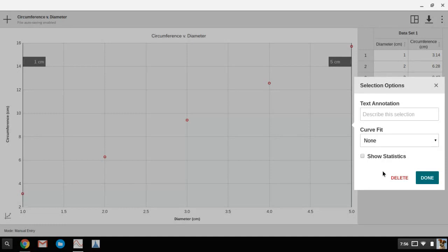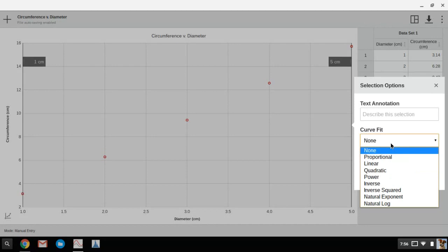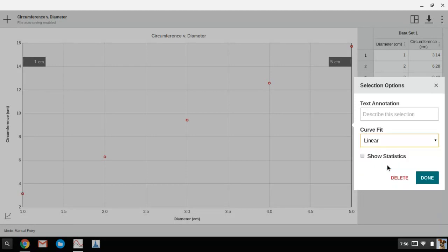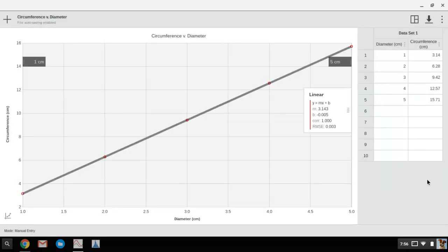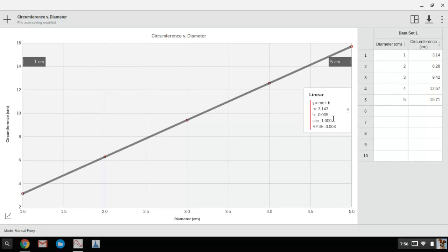And you get this box of options that shows up, and under curve fit, if it is a linear line, straight line graph, then we're going to choose linear and click on done. And there's my line of best fit. And then in this box right here we have our M, which is the slope, B is the y-intercept.